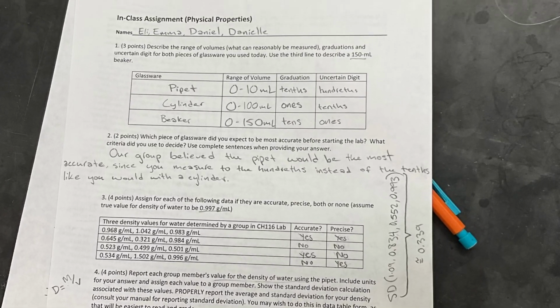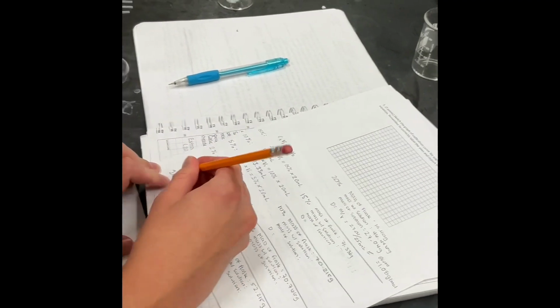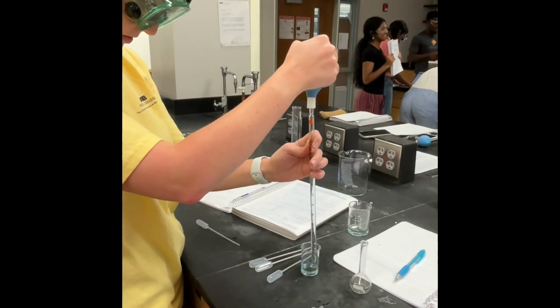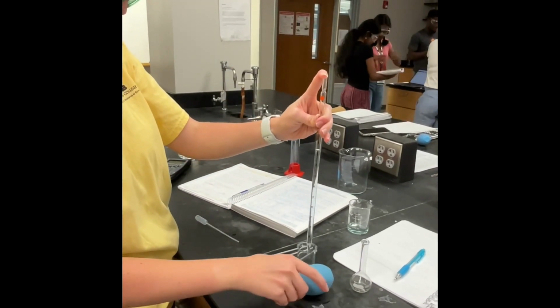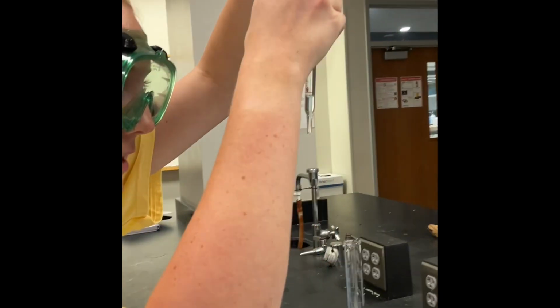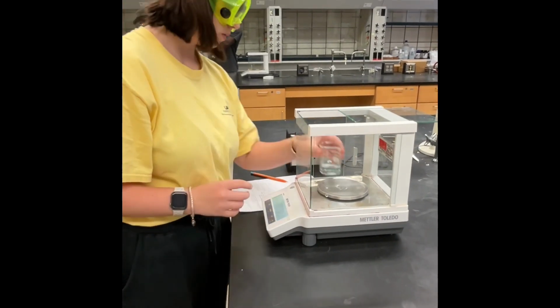Repeat the procedure of the first dilution for each concentration, 15%, 10%, 5%, and 2%, as well as their predicted volumes calculated previously using the dilution equation. Afterwards, using the calculated values for mass and volume, calculate density for the sugar solution, followed up with creating a graph comparing concentration on the x-axis to density on the y-axis.